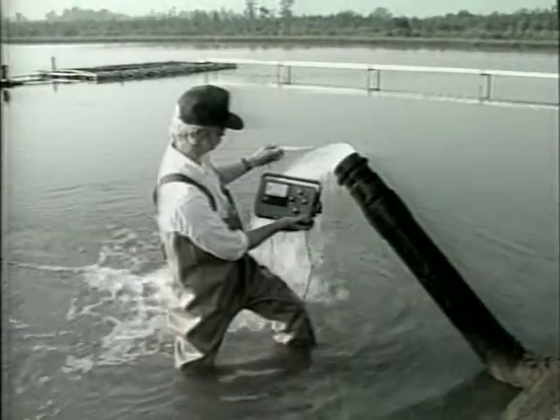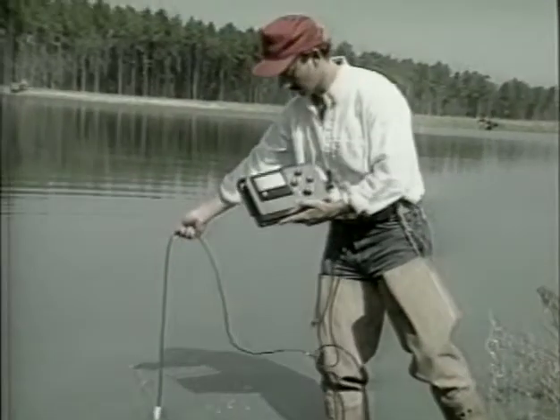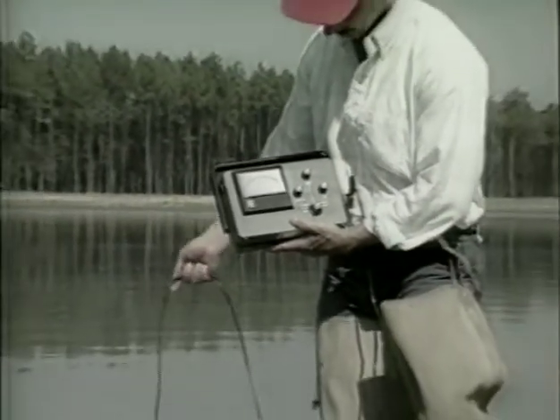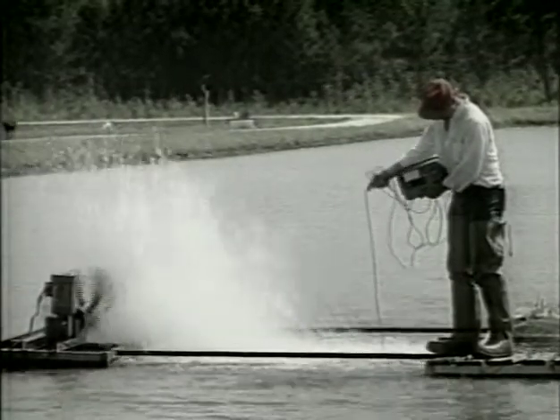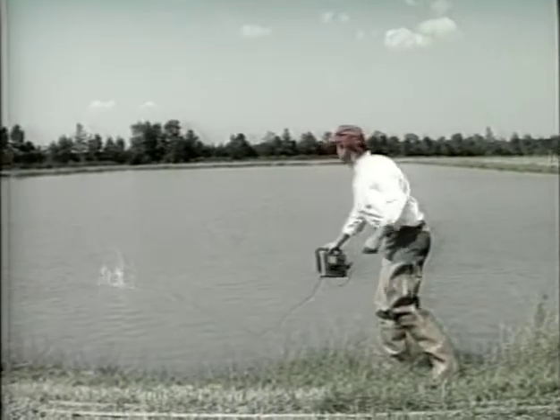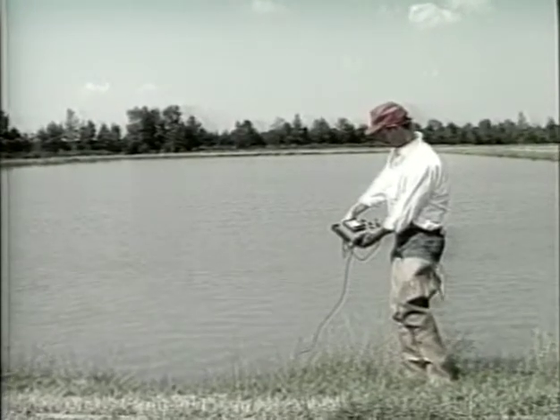If the oxygen reading is made near incoming well water, as shown here, the value will be low since well water is low in oxygen. On the other hand, if oxygen is measured in dense algae bloom, the reading will be abnormally high during the day and abnormally low at night. Oxygen will also be higher near aeration devices. It is also unwise to simply throw the probe out into the pond, since the probe and cable may be damaged and the probe will sink into the mud.